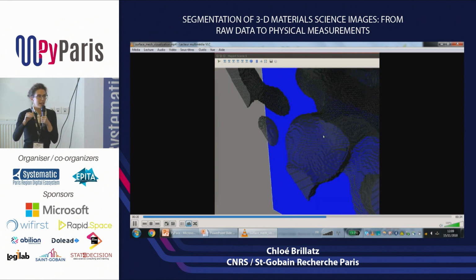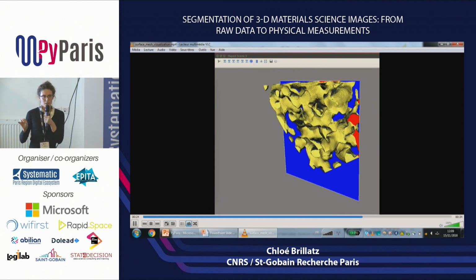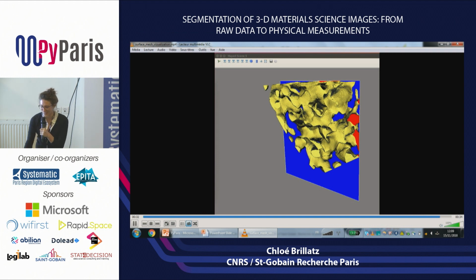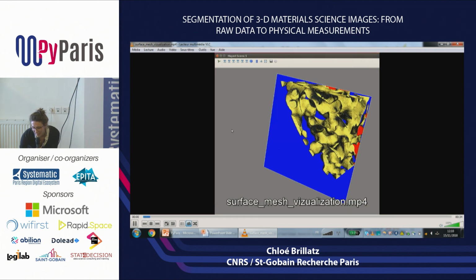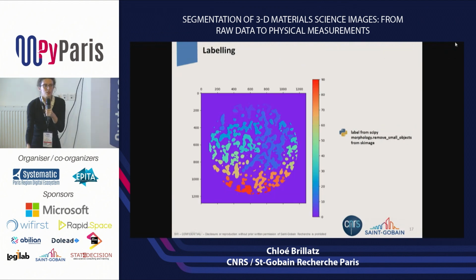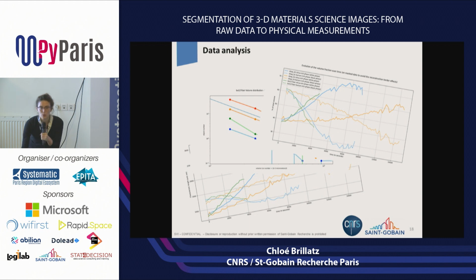And it's also at the edge of my volume, so that I can see how the surface meshing is, the shape of it, if it works well. Sorry, at the edge of the cylinder. Then I calculated also some labeling to be able to do my statistics, to have the numbers, the number of my objects. And thanks to all of this, I could do science.